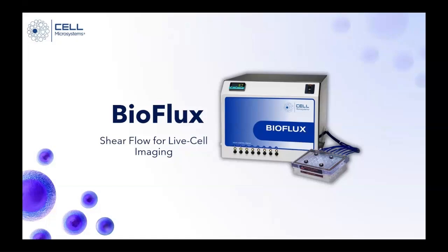Let's get started with the first question that we have. Can this device be used for algae cells? We are interested in filamentous type algae. Also, what is the best criteria to choose the right type of plate? Finally, can the adapters for the inverted microscope fit any other type of microscope? We have a multi-purpose microscope, inverted fluorescence and bright field. Is any demo available in place? Thank you for your presentation and response.